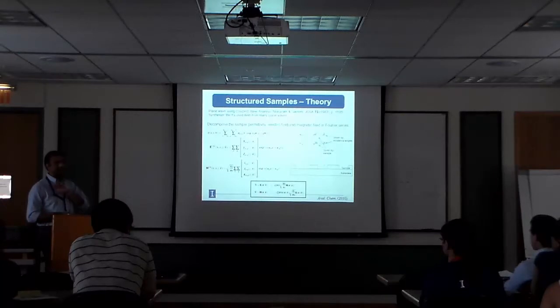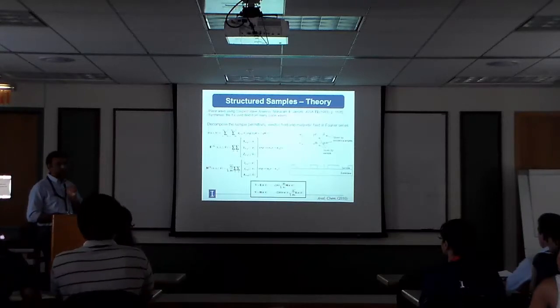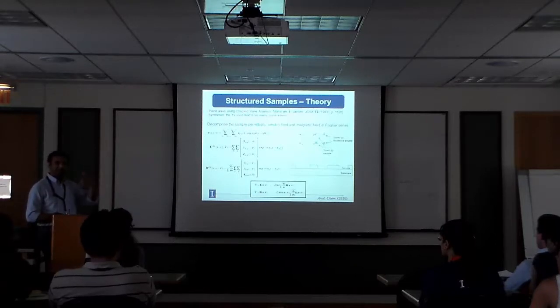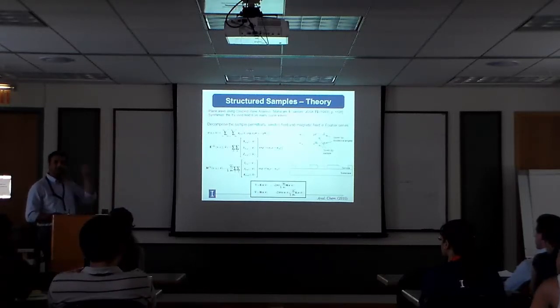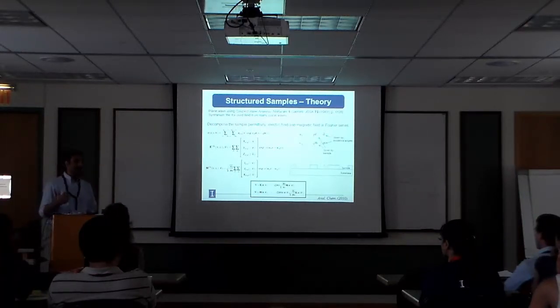Now if you have a 2D sample, so these are thin samples, remember, thin compared to the wavelength in general, then you have two spatial frequencies. Of course, you could have a third spatial frequency if it were a thicker sample, but you have two now. So there are 4 frequencies that you have to be aware of, and at least 3 of them have to interact. You can take the wave number to be a separate frequency because you can just loop over it. But the angular frequency has to interact with the 2 spatial frequencies. So it's a coupled system of 3 frequencies and a loop of a 4th. So you have 4 loops with 3 of them coupled.